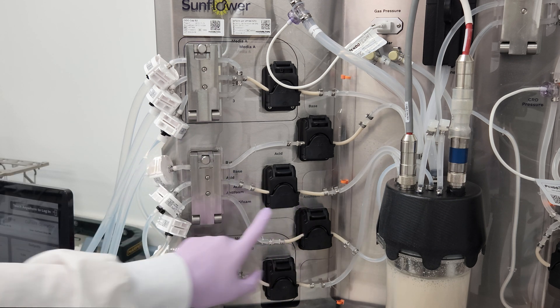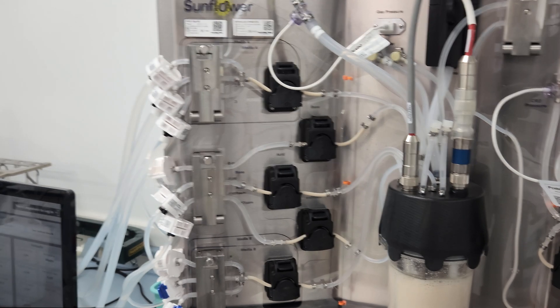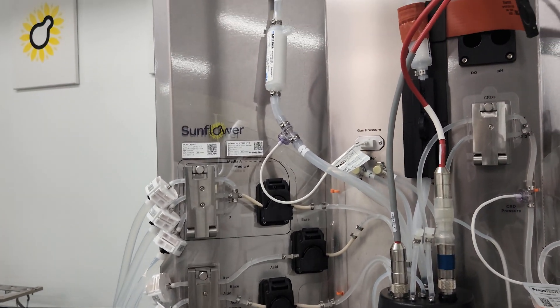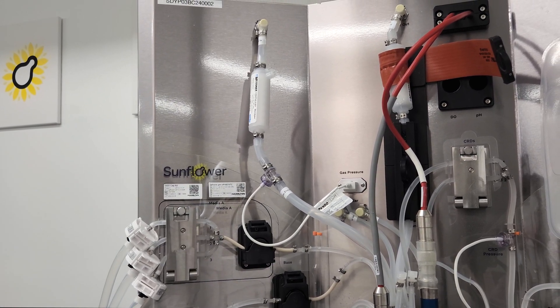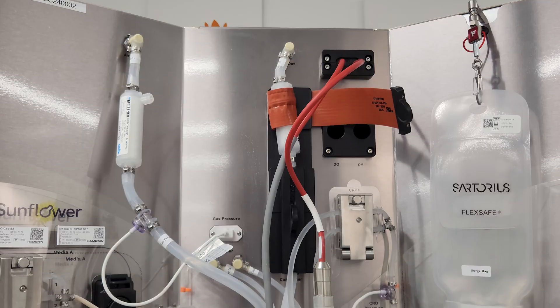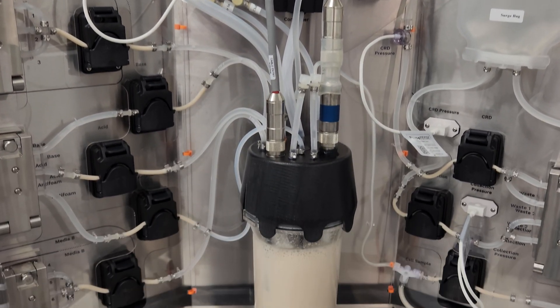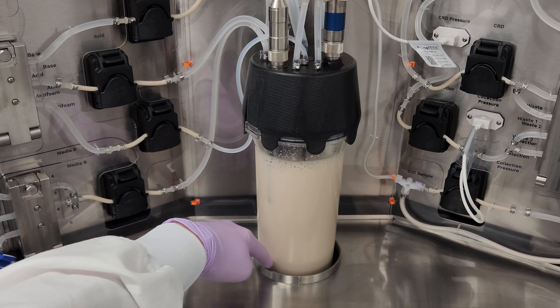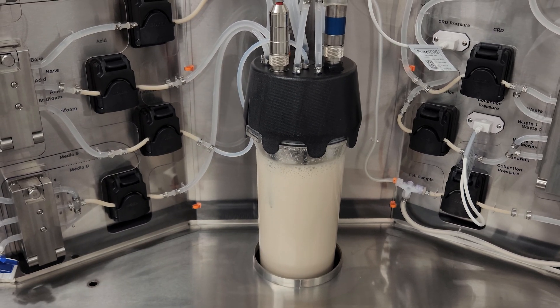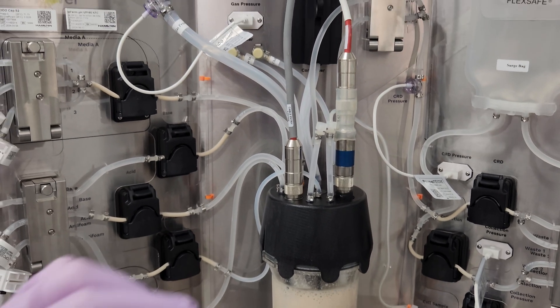These two pumps are for base and acid, respectively, to control the pH in the bioreactor, and this final pump is for antifoam addition to mitigate foaming in the bioreactor. Up here, we have the filtered air inlet line that supplies a blend of air and oxygen to the bioreactor. The center panel is where the fermentation action happens. The bioreactor sits in a cradle that monitors its weight throughout the fermentation process to maintain the fluid level inside the vessel. The cradle also houses the motor that drives the agitator in the reactor through a magnetic cup plate.